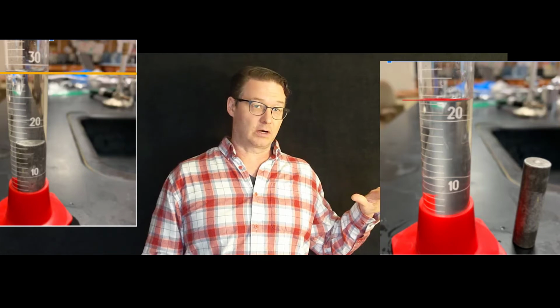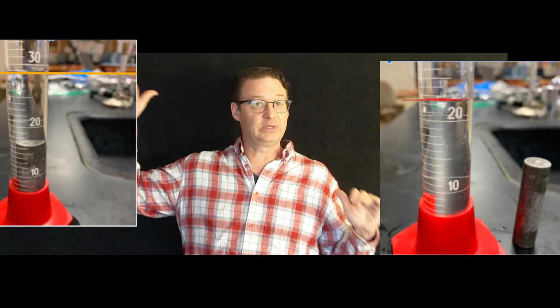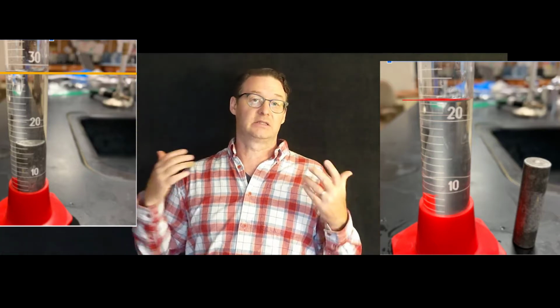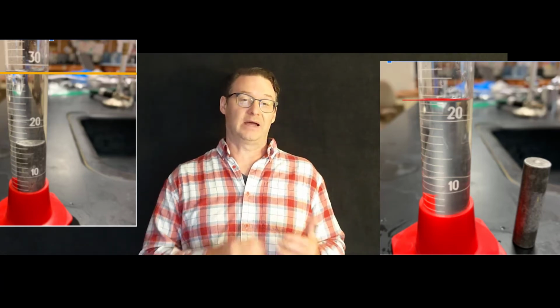Well, if we have water in the beginning and water plus aluminum at the end, what we need to do, and we'll do this in the calculation, is find the difference between these two measurements. The difference between the water levels is the volume of the cylinder that we put in. This is known as the displacement method. We're measuring the volume by how much water it displaces.